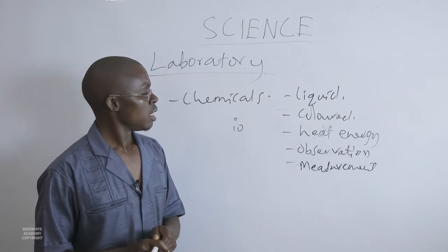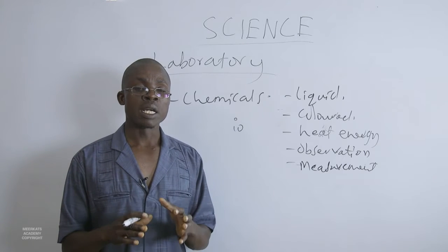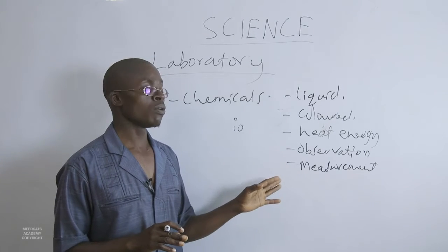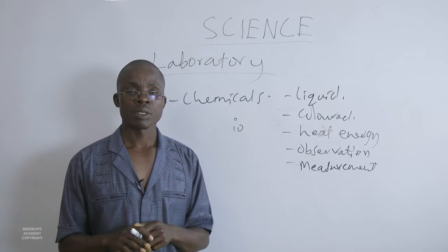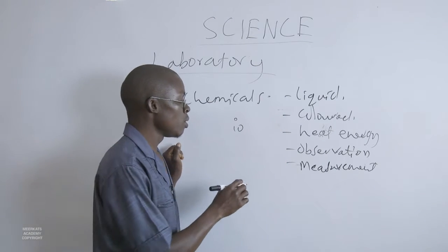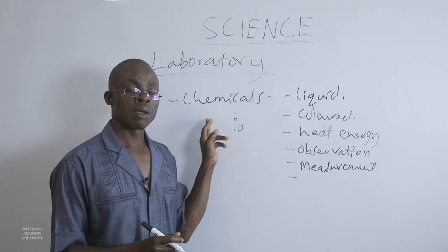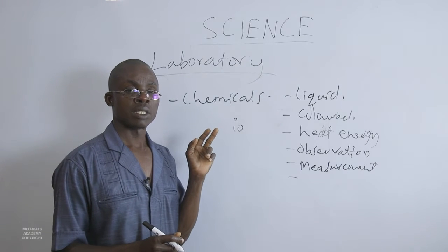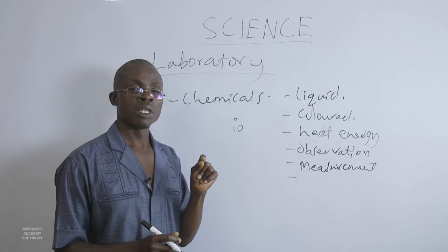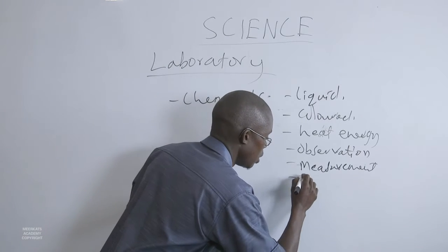These are the major areas as we are looking at the chemistry lab that we have always to remember. And lastly, over the same, we have to remember that we are talking about chemicals. And chemicals are dangerous if wrongly used. So lastly, we have to look at rules.